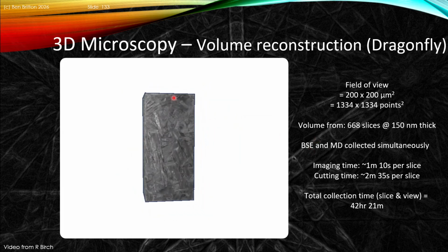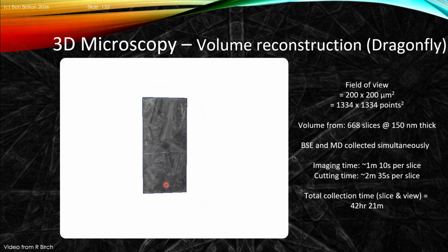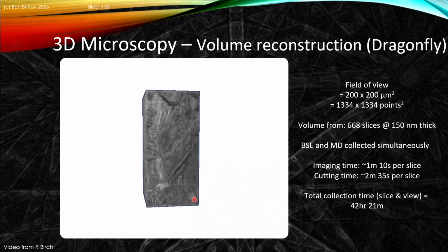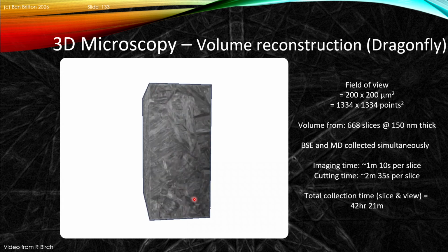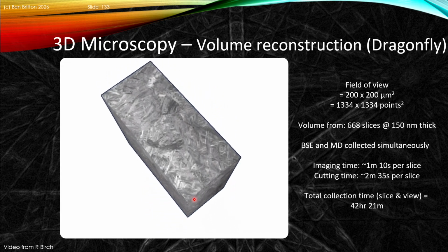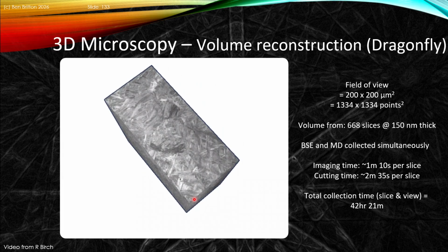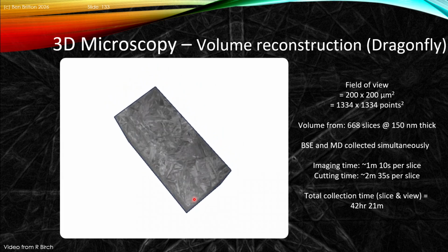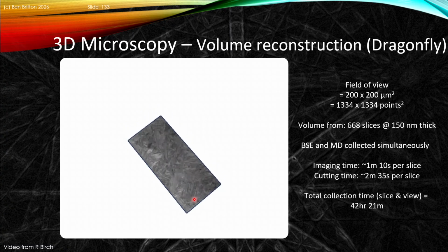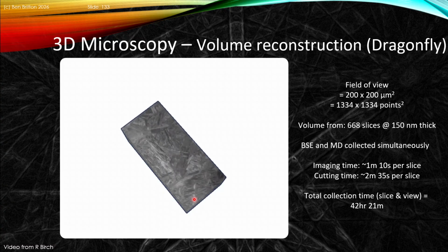What's super nice is that in this setup it's very well aligned, that you can't really tell which direction each of the slices were reduced. There's not too much of a misalignment error in this data set. It's quite stable for how this is operated. And that's particularly how our microscope has been configured to enable this to be easy to do and enable us to reduce the amount of digital alignment steps we have to do in our data sets.